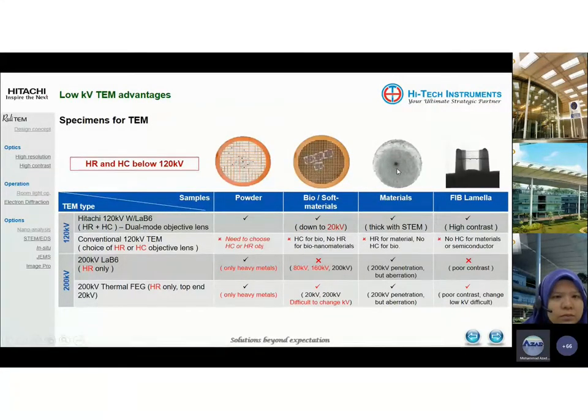This is another type of material sample, but it is prepared using thinning and polishing of the sample. And this one is another available TEM sample prep. We call it FIB, focused ion beam. It is not so common in universities because focused ion beam is quite good equipment that uses an ion beam to thin down your sample to prepare a very thin layer. If you look with your eyes, the more transparent the sample is, the better it is to be observed in TEM.